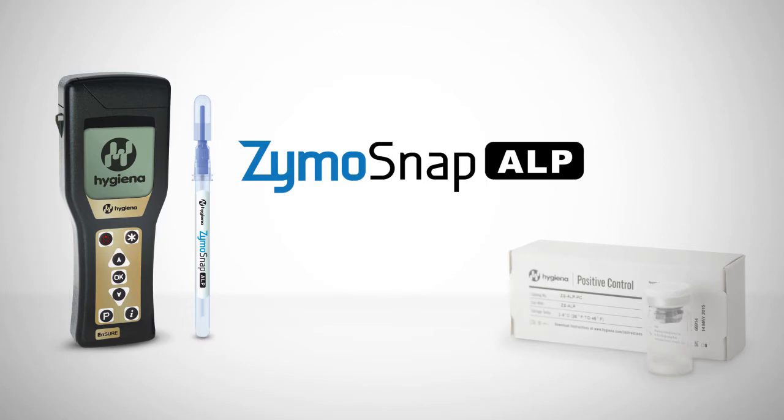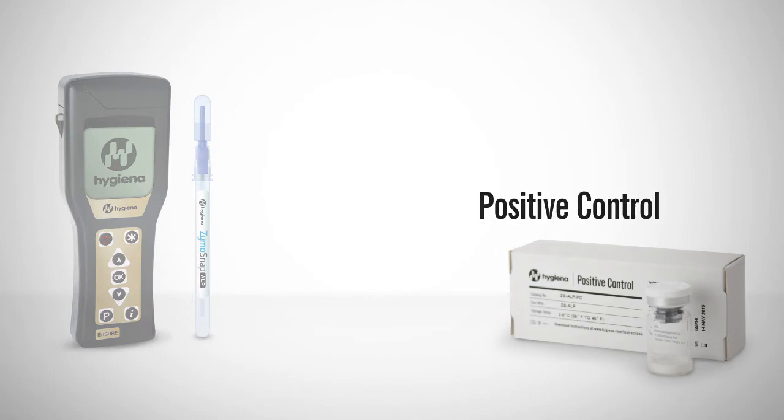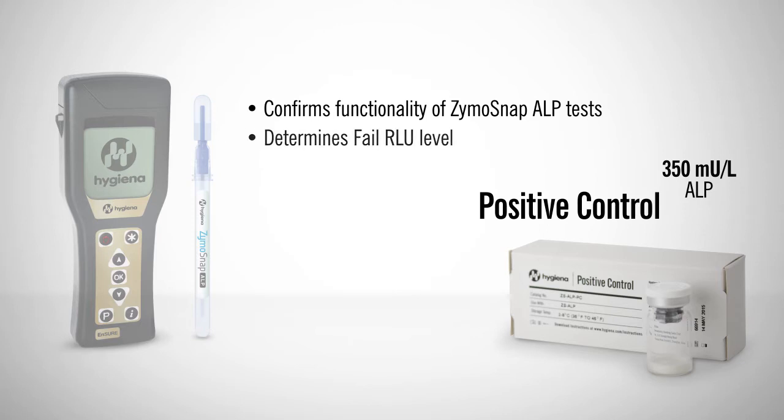A positive and negative control should be run initially to establish a fail RLU level, then monthly for confirmation and with each new manufacturing lot of Zymosnap ALP test devices. The positive control kit for Zymosnap ALP devices consists of 5 vials of 350 mU per liter of ALP — the globally recognized regulatory maximum for ALP levels in pasteurized milk products. The positive control confirms the functionality of the test devices and determines a fail RLU level for operational testing.